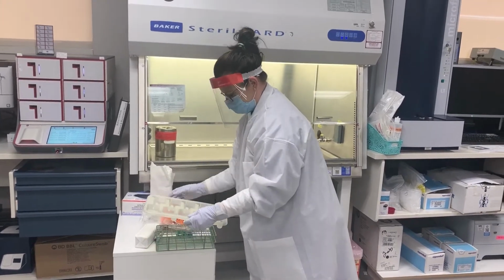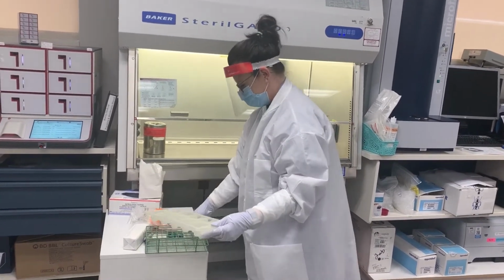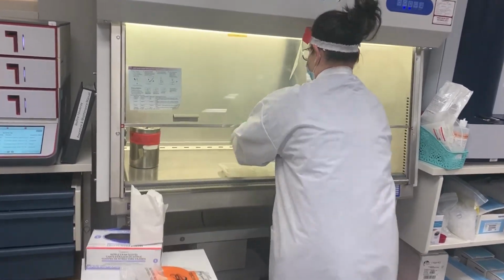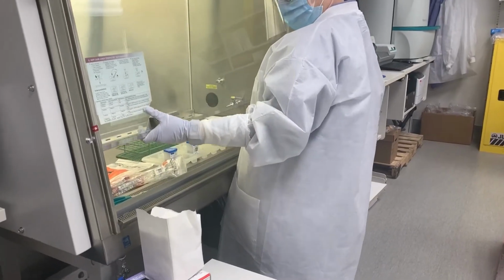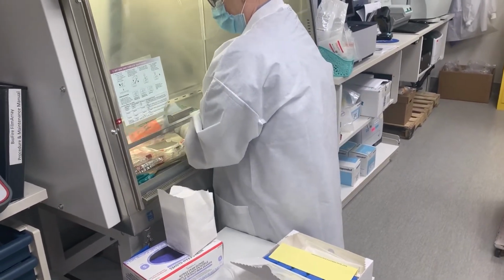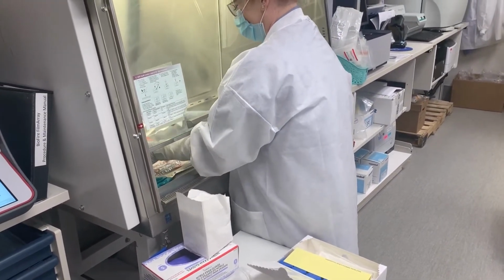Once Jess has on her PPE, she is now ready to set up testing. So she's going to make sure she has all of her supplies in the cabinet. Jess is lowering the door on her safety cabinet to make sure it's at the proper height to allow for proper airflow.